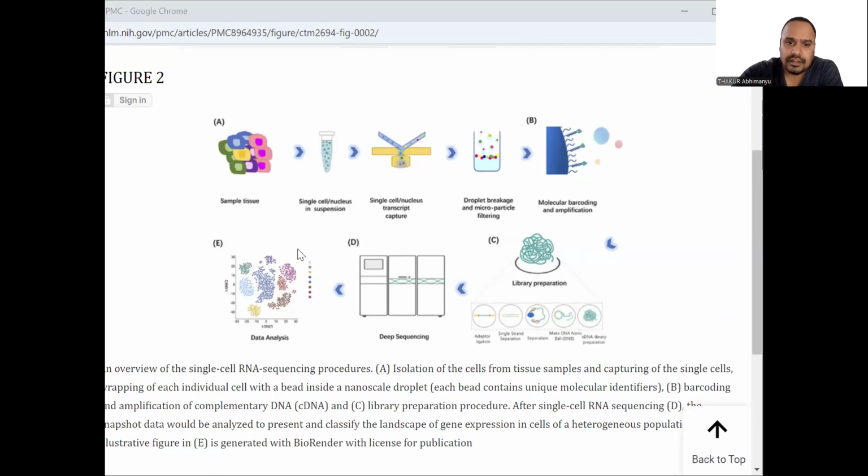This technique is quite useful, and understanding it involves understanding cellular heterogeneity and biological processes at various levels. This powerful approach allows us to examine individual cells within complex tissues and populations, and that reveals insights that were previously masked by bulk analysis methods, for example bulk RNA-seq data.